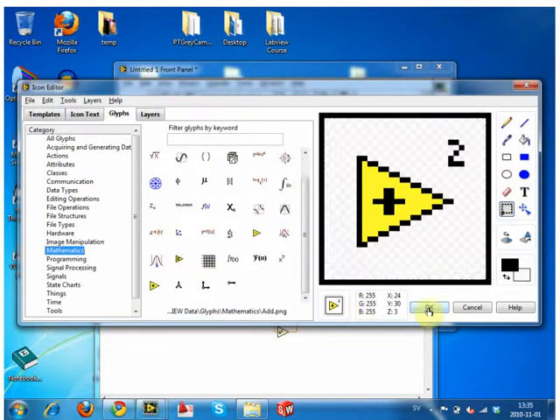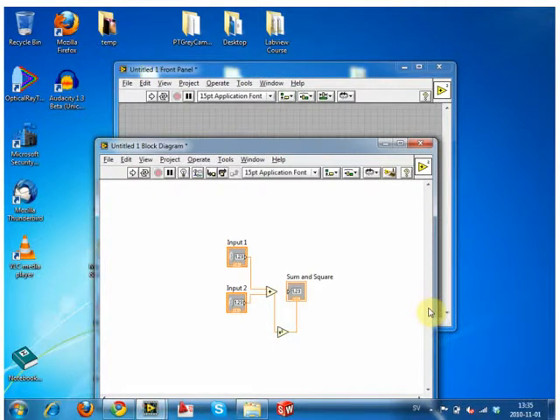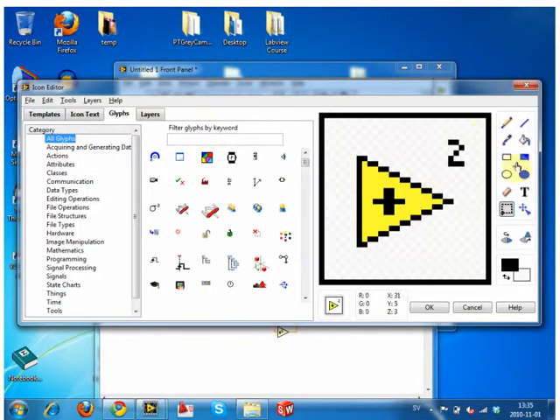Can we just write some words on it without any symbol? Yep. Just like I did with the 2, just hit text. Maybe not there, so you can see it. This is square. Just click on the text symbol, the T, and then just put the number 2 somewhere on the power. So just click somewhere and then write 2. Maybe not quite that high, click further down on the screen.